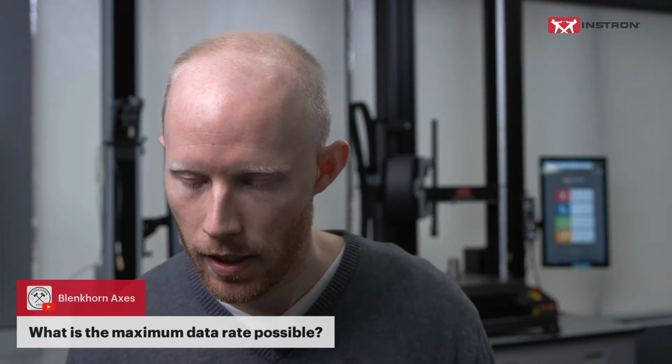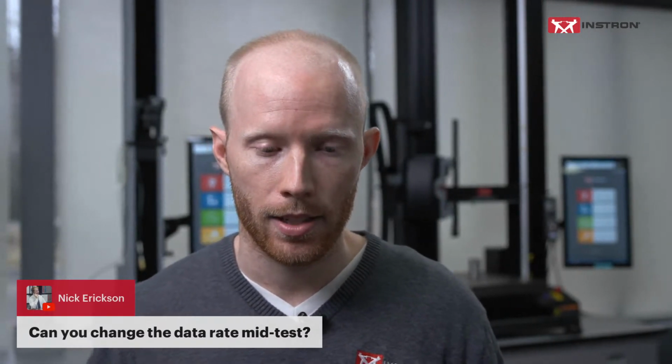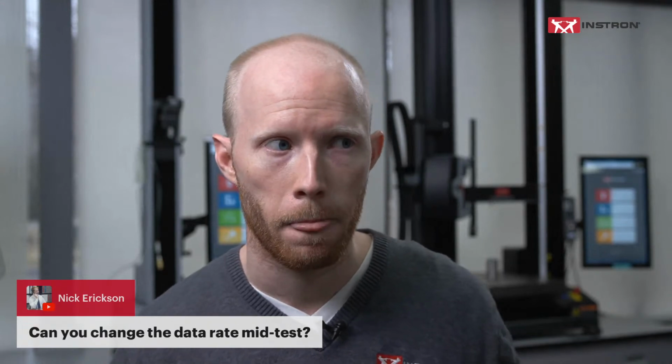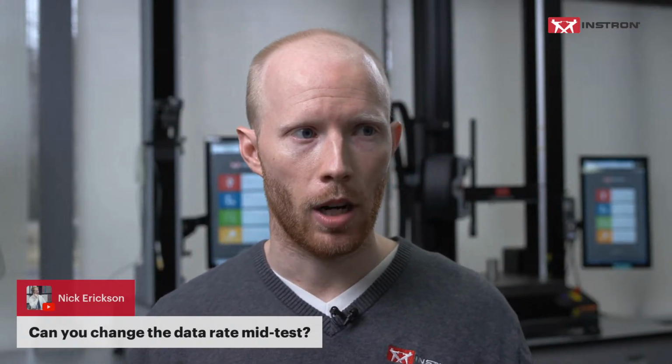All right, let's get another one. I see, can you change the data capture rate in the middle of the test? That is something that you can do. One way that is standard and built in is what I had just shown, setting different measurement sources as the different criteria for triggering the different data capture rates at different points in the test. But that's up to what happens in the material.